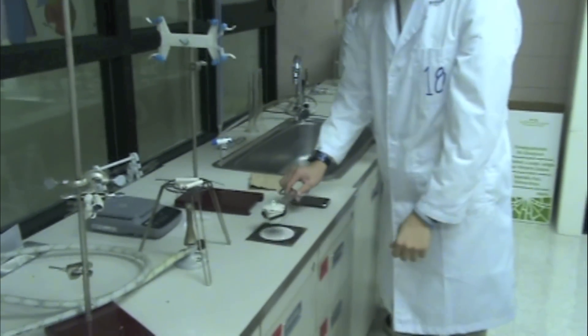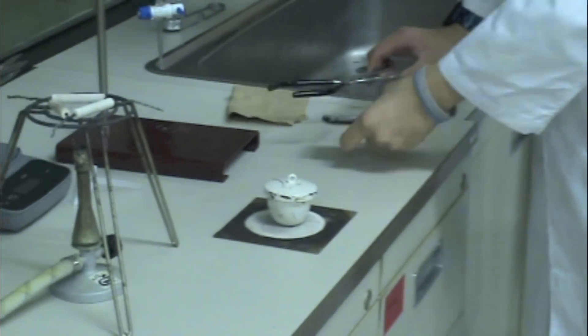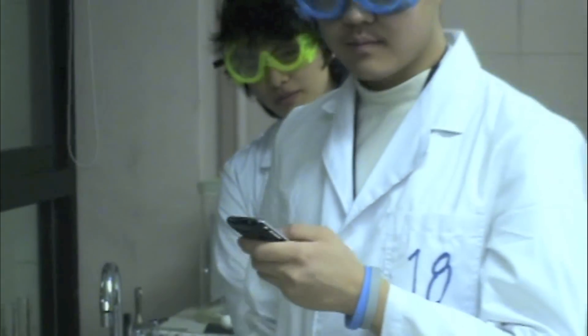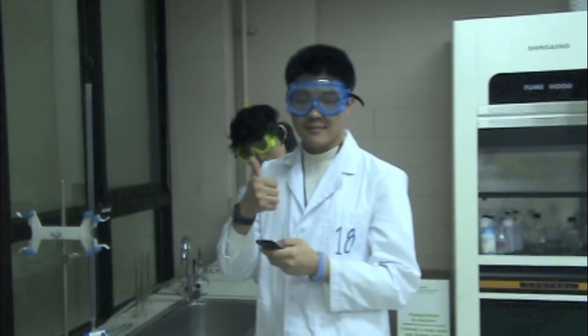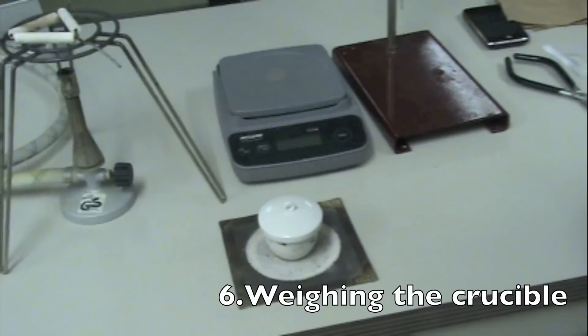Also, don't forget to close the lid during the cooling to prevent outside contaminants from entering. Allow both the crucible and lid to cool to room temperature on the wire gauze.